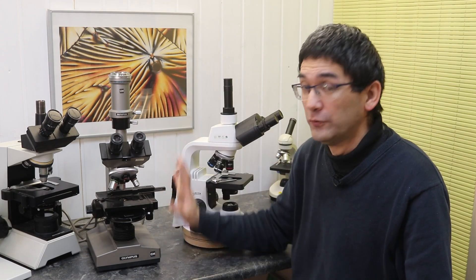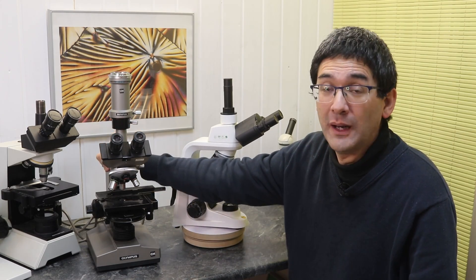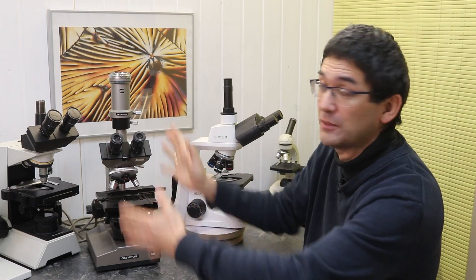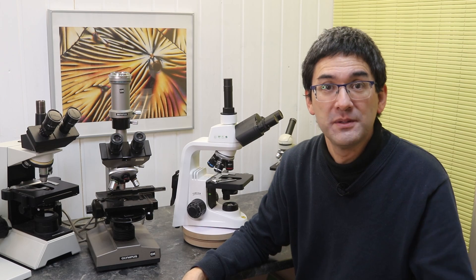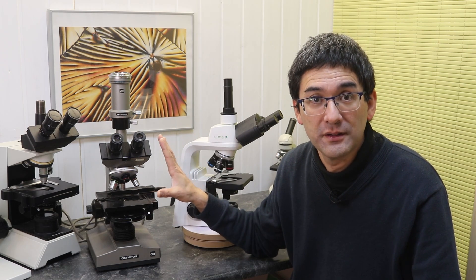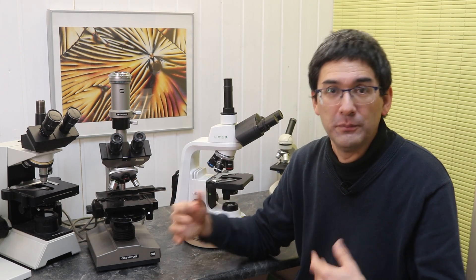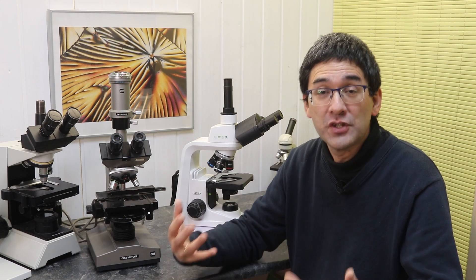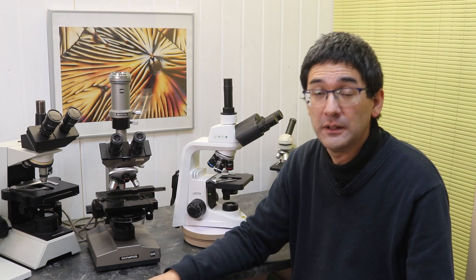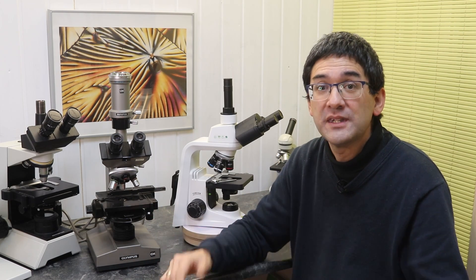But the overall value - I could go out and probably sell this whole system here maybe for a thousand or a thousand two hundred, and I might still find people who are willing to pay for this. I'm not going to do that, but I just wanted to show you that this whole concept of reselling a used microscope after it's been refurbished is a thing, and there is a certain market segment for that as well.